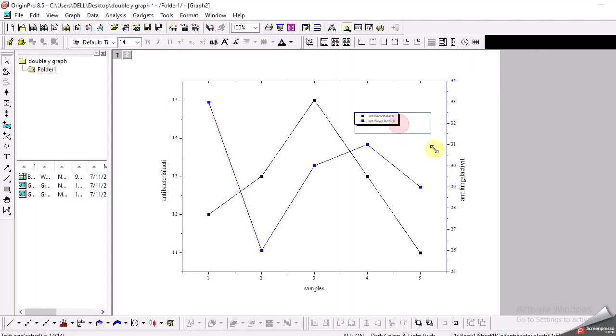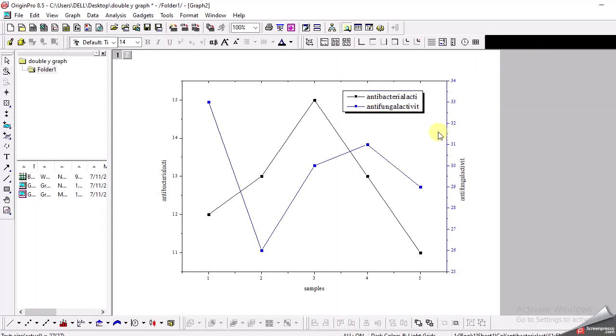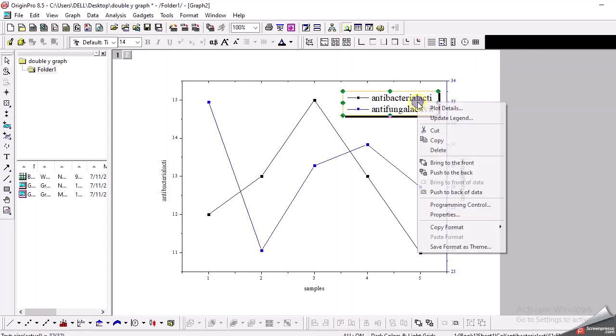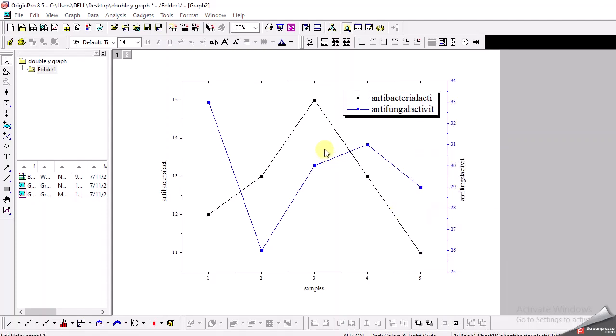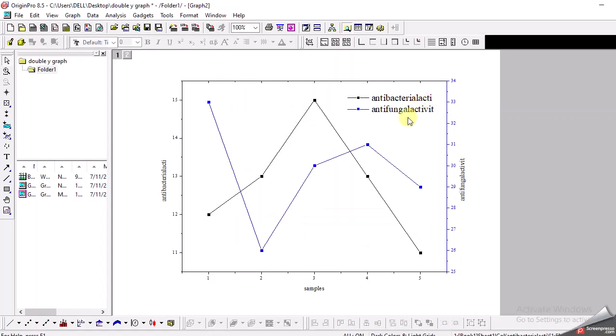You can do the formatting and increase the size so that you can see the labeling. Usually I go to the properties and remove this background to none like this.